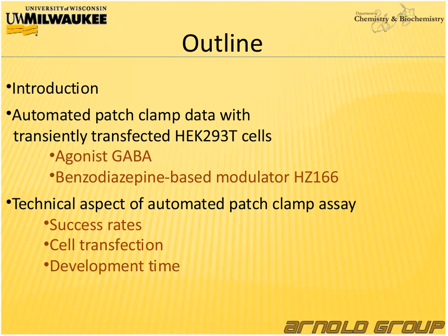And then in the second part of my talk, I would like to address some technical aspects of the automated patch clamp assay. So I will address the success rates, the transfection protocol we developed, as well as our development time.